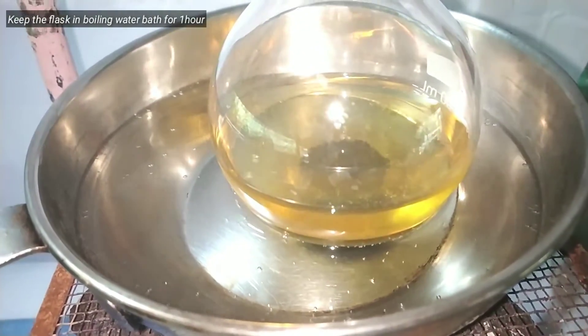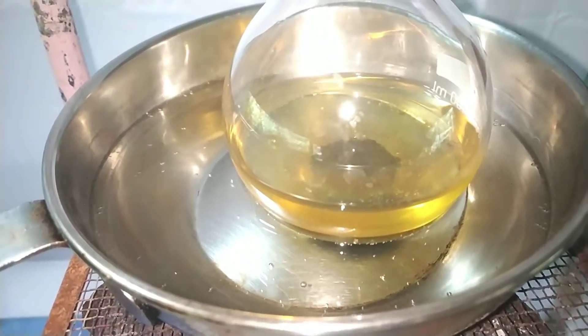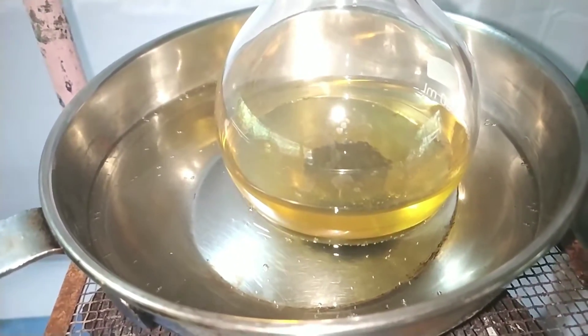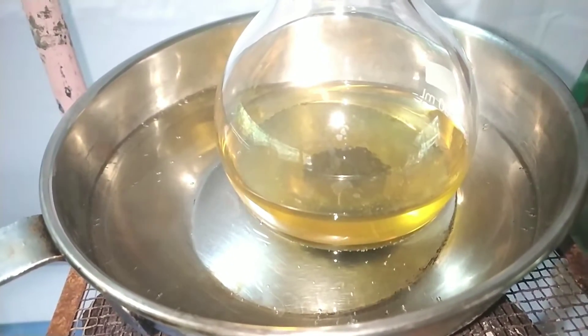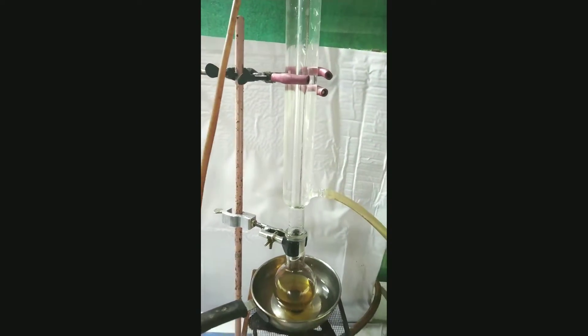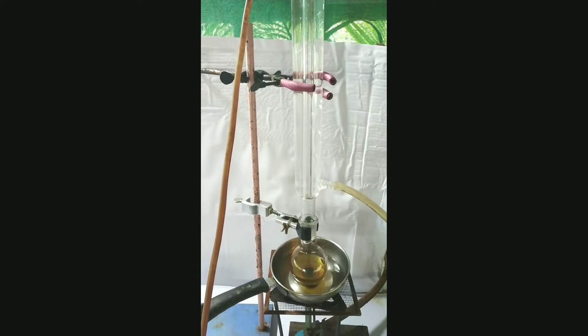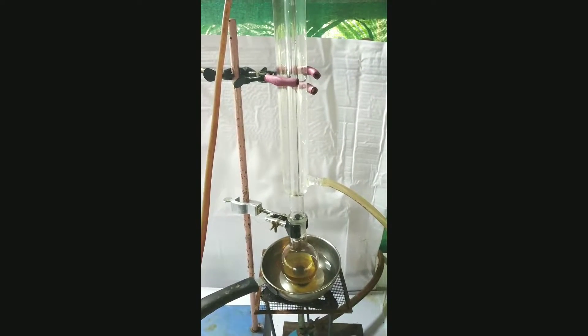When the complete acid has been added, we keep the flask in boiling water bath for about 1 hour. Here is the complete view of the reflux mechanism and the flask is now sitting in boiling water bath.